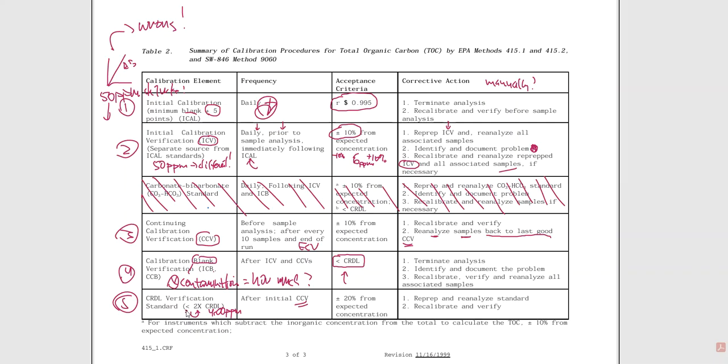And notice it says plus or minus 20% from the expected concentration. So yet again, a threshold. And this threshold is on the lower end of the detection limit that we are claiming that we can report. And because it's on the lower end, things get a little weird down here. These numbers are very often smaller. A little bit of variation here can make a massive percent change if you're not very careful. So the threshold window opens up for us a little bit, just to give us that extra wiggle room. So if things change very, very tiny, that maybe will lead to a large percentage.